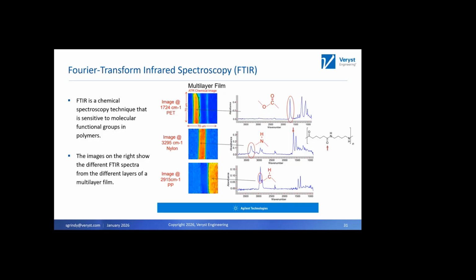What I find FTIR to be useful for in 95% of applications is purely material identification. If you have some question about the provenance of your polymer, you don't know what the base material is, or you're worried your supplier gave you the wrong material, you take an FTIR spectrum. This is non-destructive. It takes only a few minutes to collect the data and compare it to a database. That database can be something you have generated, your historical library of FTIR spectra, so you can say, this one is different.